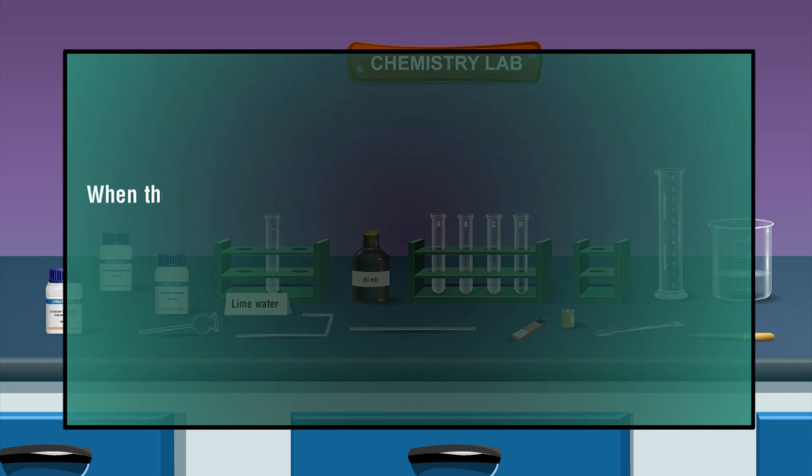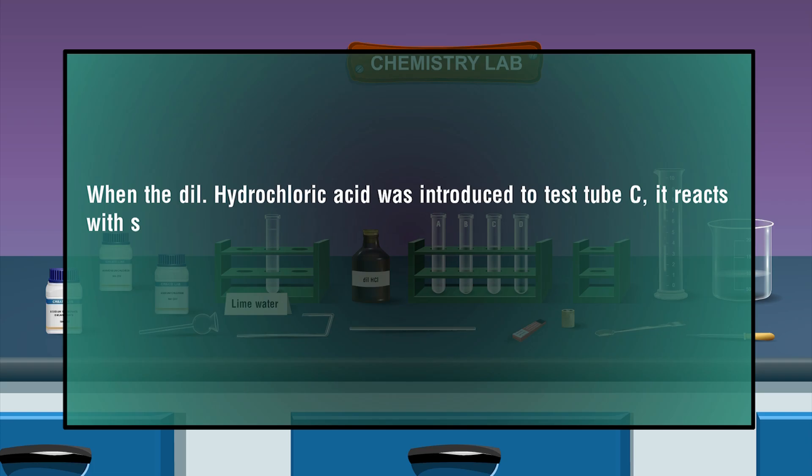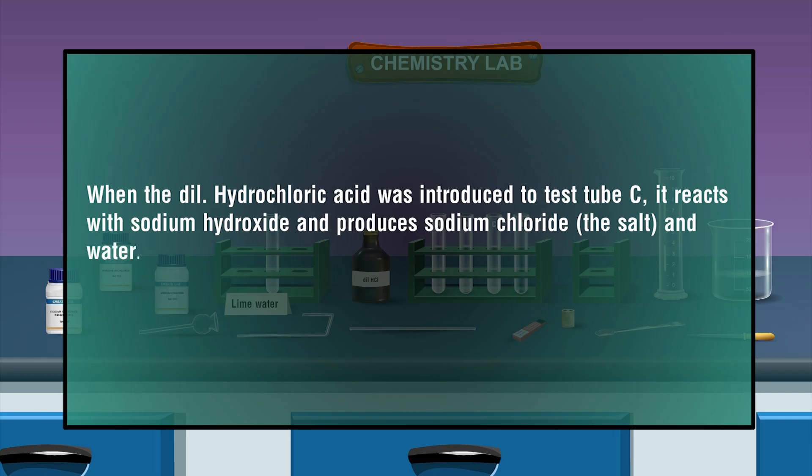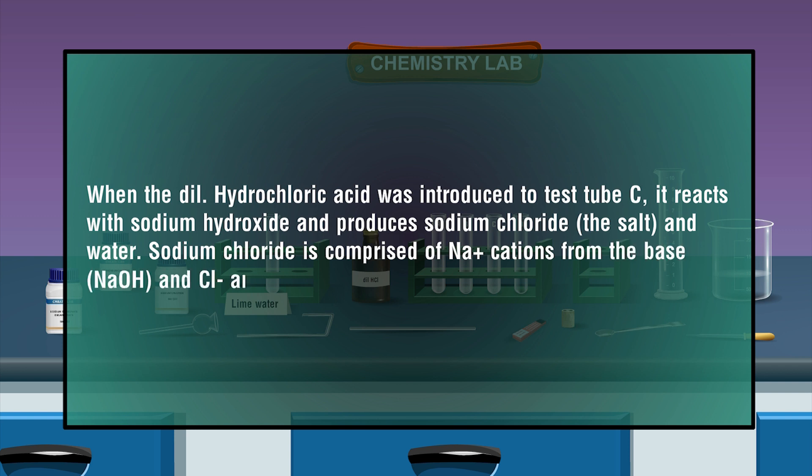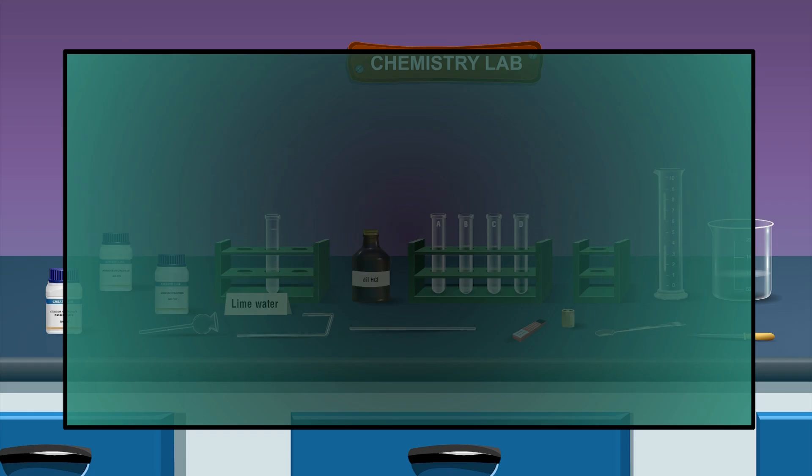When the dilute hydrochloric acid was introduced to test tube C, it reacts with sodium hydroxide and produces sodium chloride, the salt, and water. Sodium chloride is comprised of Na+ cations from the base NaOH and Cl- anions from the acid HCl. HCl plus NaOH gives H2O plus NaCl.